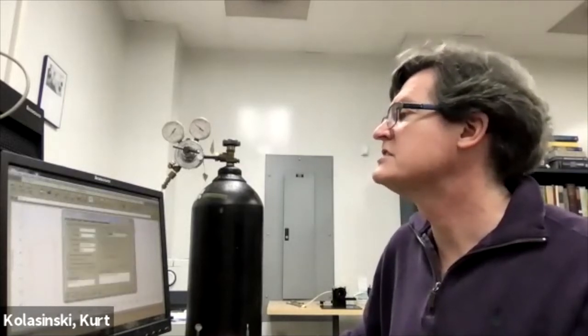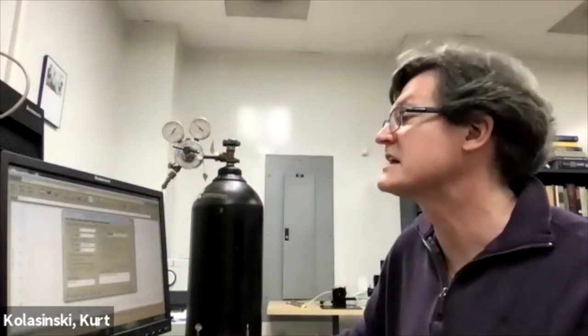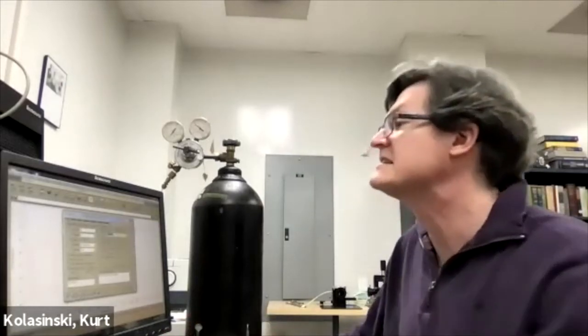There are going to be some real changes in the spectrum when we measure under different circumstances. If you change the number of spectra that you run, it's going to take longer. It actually tells you up here, estimated time for this collection. It's always an underestimate because there's a little bit of setup time. It said it should have taken 16 seconds to do 4 scans. If you put 64 scans in there, it's going to tell you it's going to take 4 minutes and 20 seconds. It takes a lot longer if you average more scans together because it keeps moving.